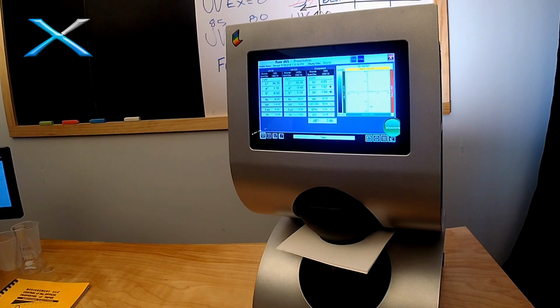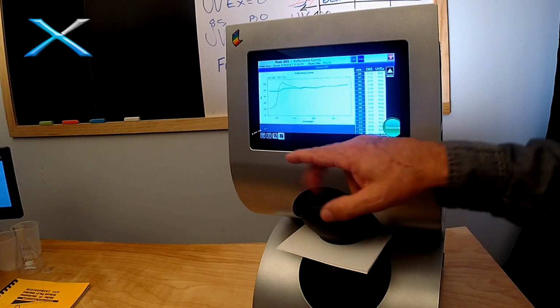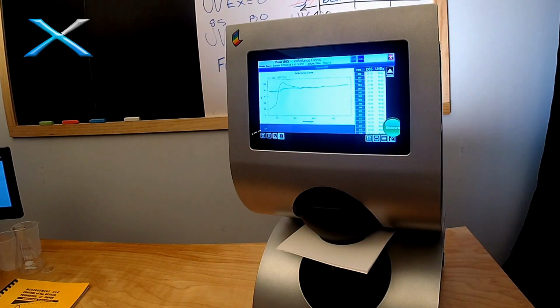So it's more than twice the amount of increase that we got under source C. You can see the impact of the optical brightener, but also the impact of the UV energy that's in your illuminating source. I'll choose the spectral curve, and again you can see this area here, and you can see a greater difference between the UV excluded data and the UV included data.